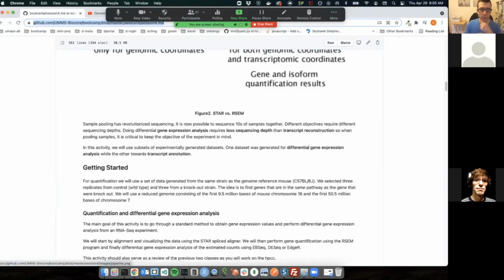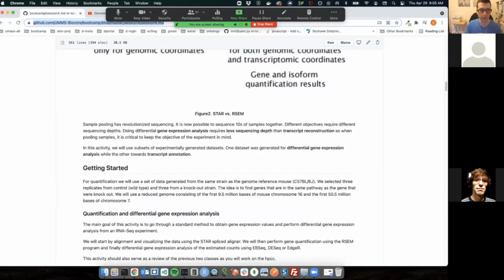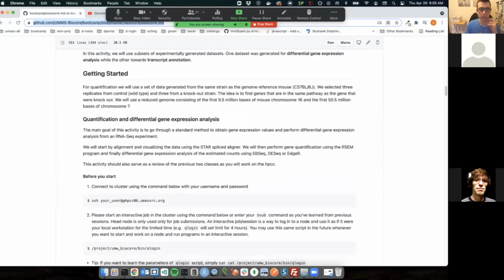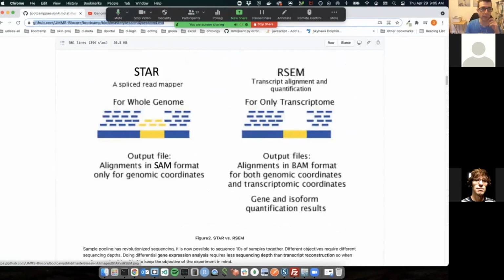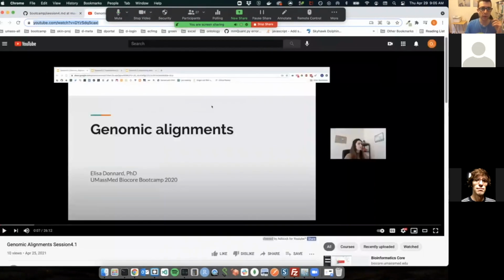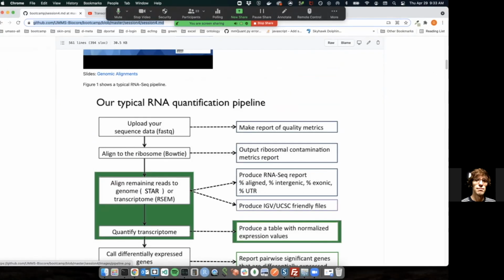So before going into details, I will start Elisa's videos. Let's start with the genomic alignment video first, and then we will talk details about it, okay? You will go through the first part of this session.